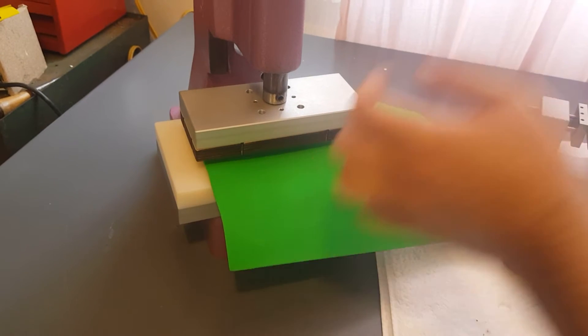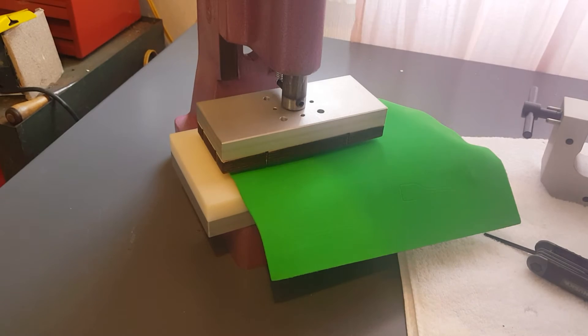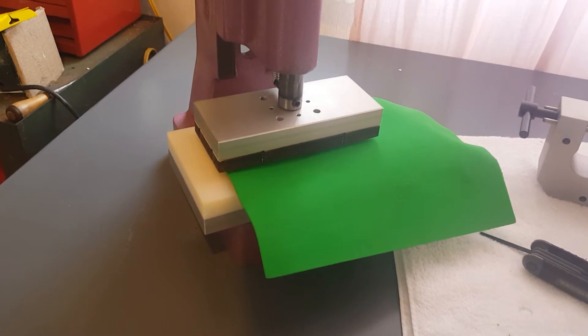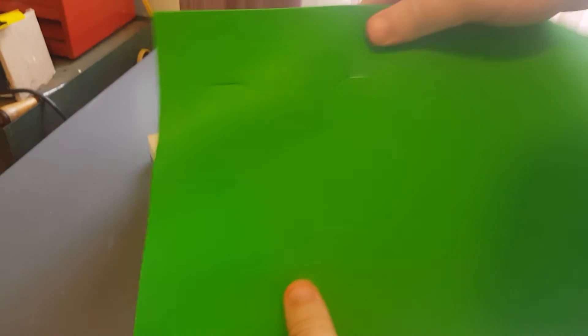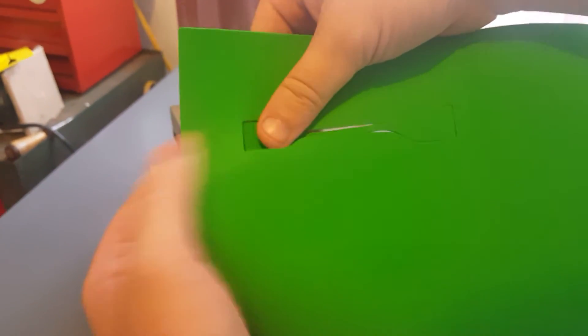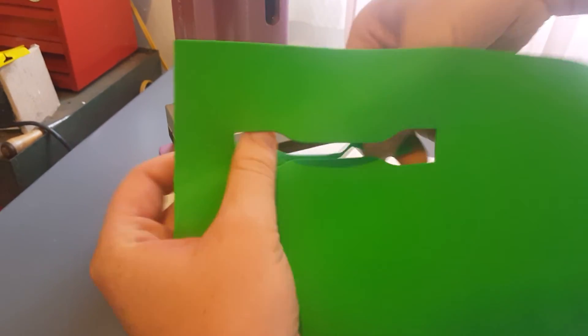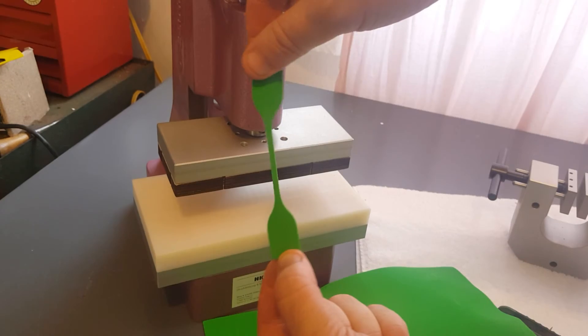Go ahead and bring the arbor press down. All right, we have our sample cut here. We'll go ahead and remove this. There's our standard specimen size.